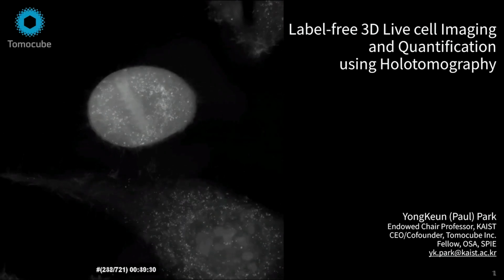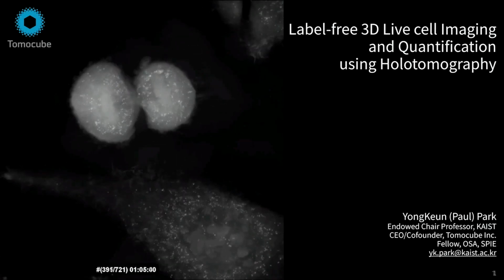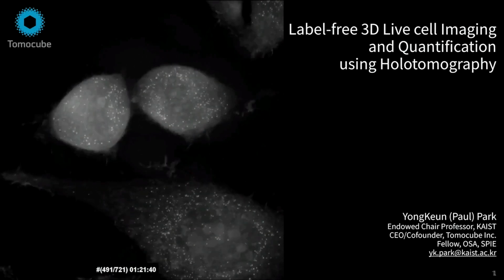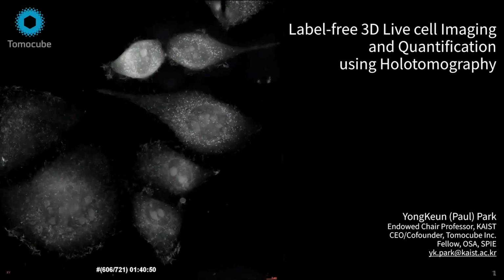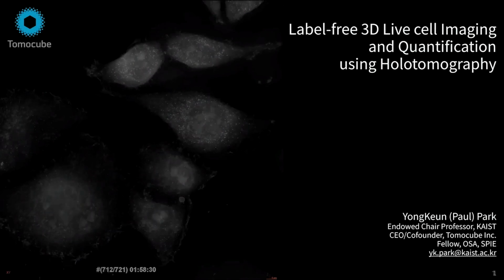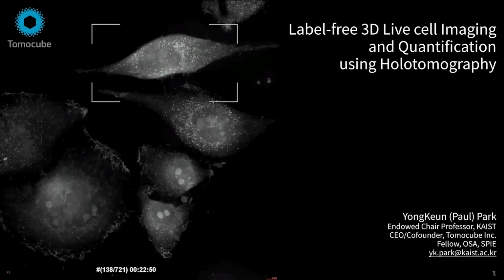Now you're watching a cancer cell line, and you can see individual subcellular organelles such as the nucleus and nucleoli. And now you're watching mitosis. So you saw the condensation of chromosomes and vivid motions of the lipid droplets and cell membrane. This is how holotomography can visualize the cells' physiological states.